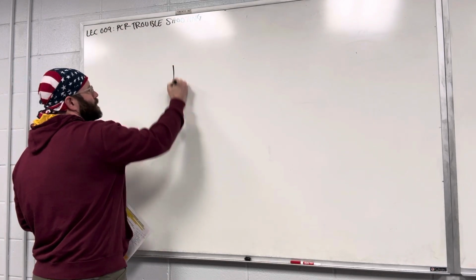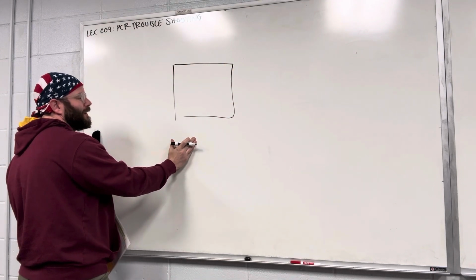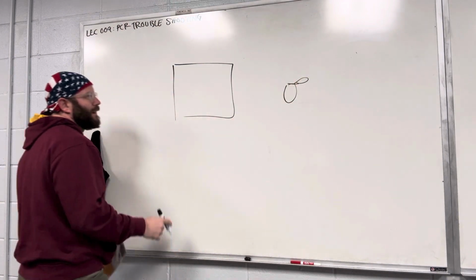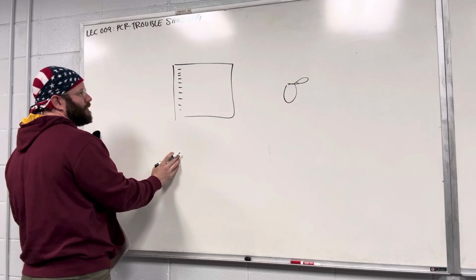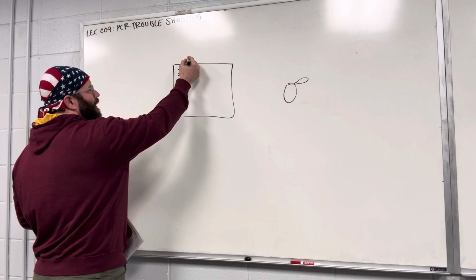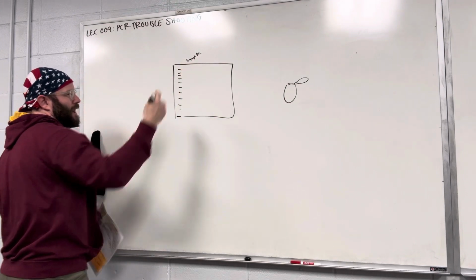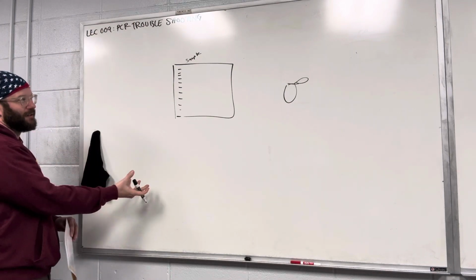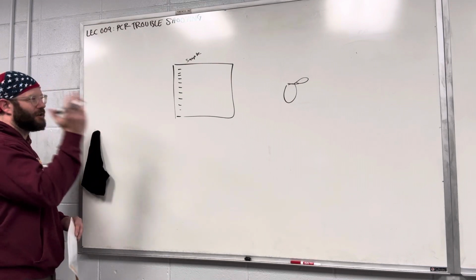So imagine you set up a PCR in a tube. And here you run your ladder. So it's an agarose gel. Here you have your sample. Okay. And imagine you run it and you see nothing. This is a common result. Because you do PCR, you see nothing. What could have gone wrong?